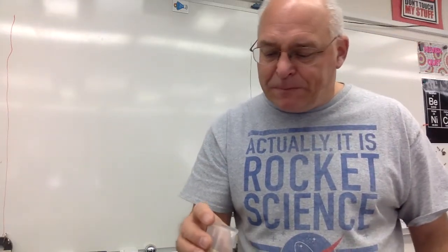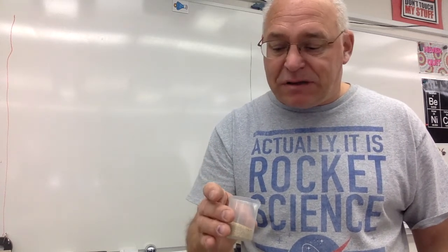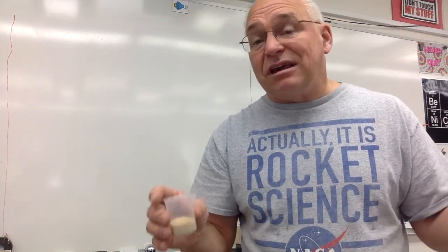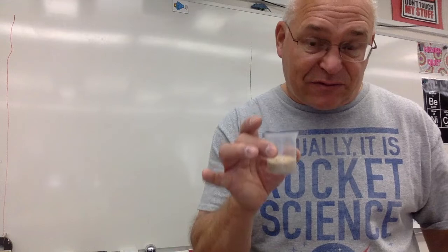To start off, we need to get the mass. And I'm doing the mass first today because once you put it in water, it's getting wet, water is sticking to it, that will affect the mass. We've got to find the mass first.